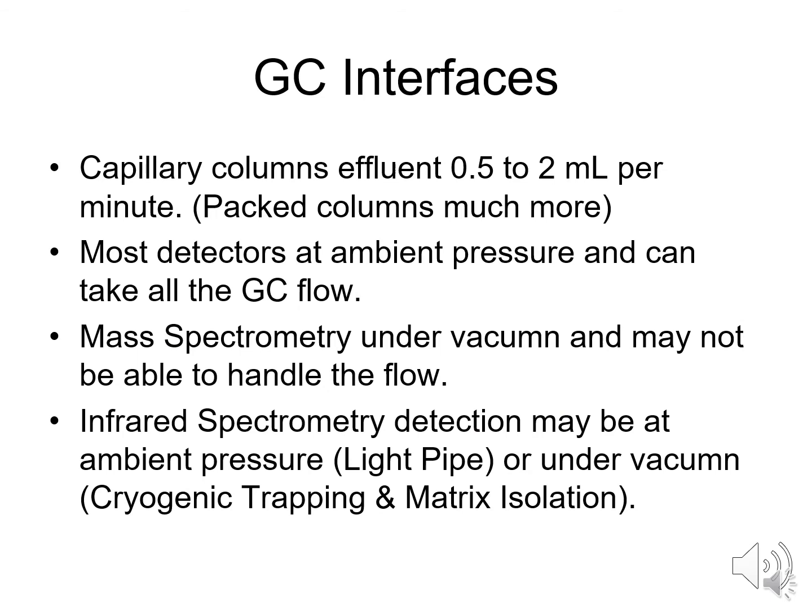Different GC-IR interface. Capillary columns have an effluent of 0.5 to 2 mL per minute. Packed columns much more, up to 30 mL a minute.